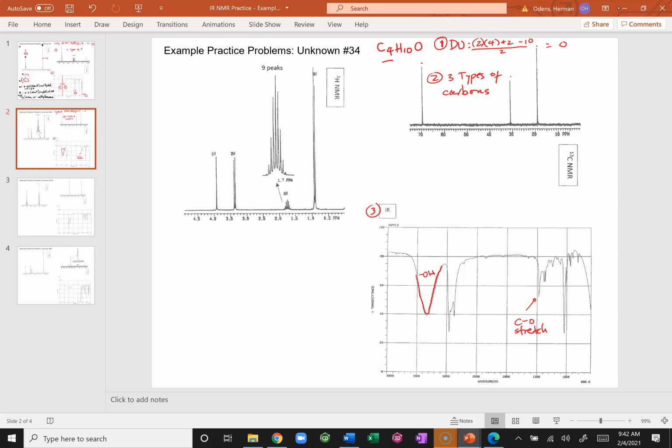All right, but I can solve for the 3000 line, the magic line. I'm going to trace it up, right? And I know that there's nothing on the left side. Everything on the left side is sp2 CHs. Everything on the right side is sp3 CHs. So I was able to assign 3 bands. That's not bad.